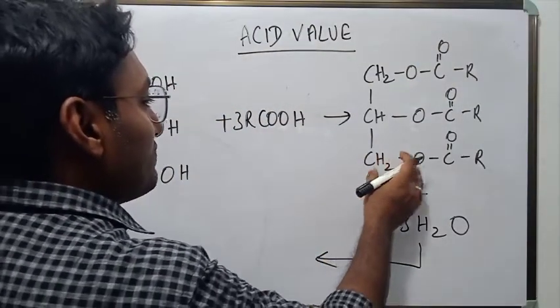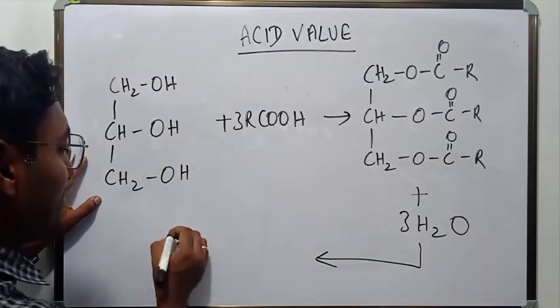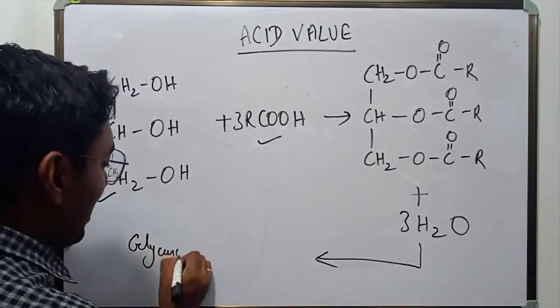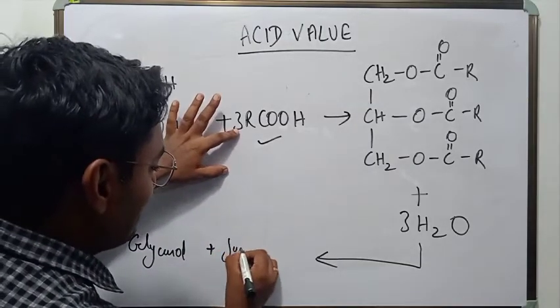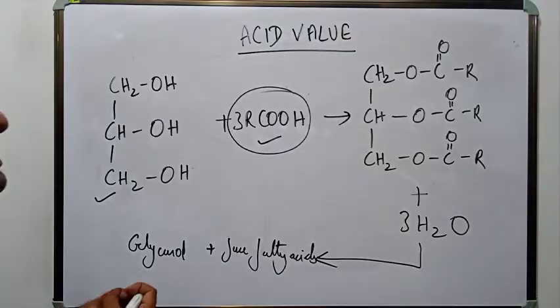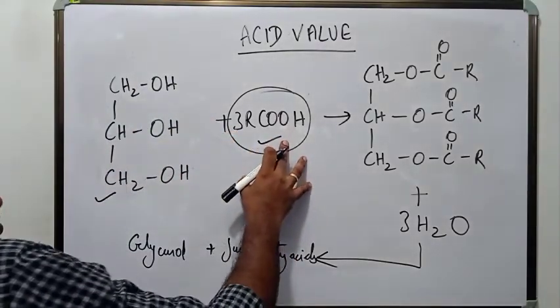So please note that when an ester molecule reacts with water, when it is hydrolyzed, what would happen? Yes, you are correct. It would give you glycerol, the alcohol part, and the free fatty acids back, right? So you would get the free fatty acids back. Now the free fatty acid won't exist in this form in the oil sample or in your groundnut oil. I will tell you in what form it exists.